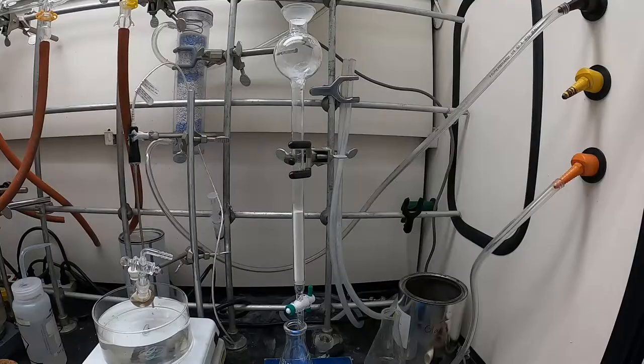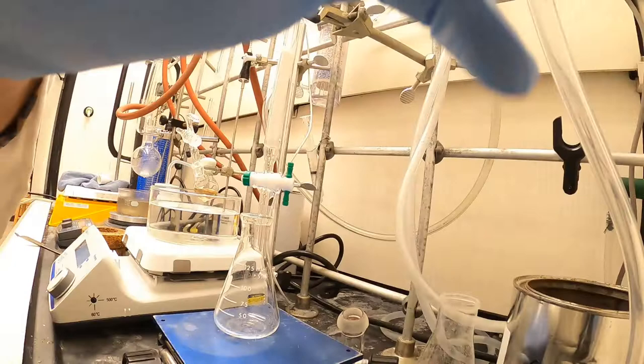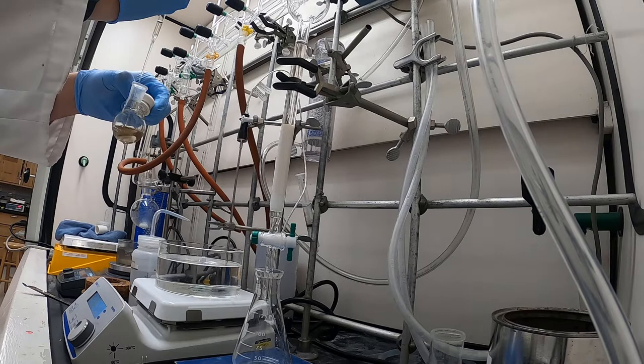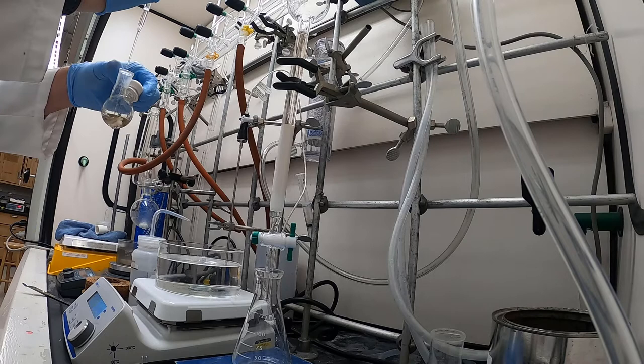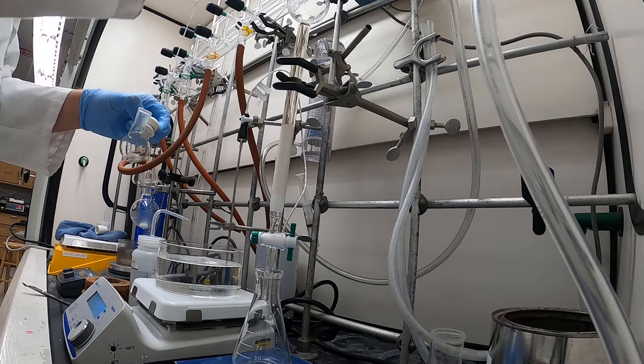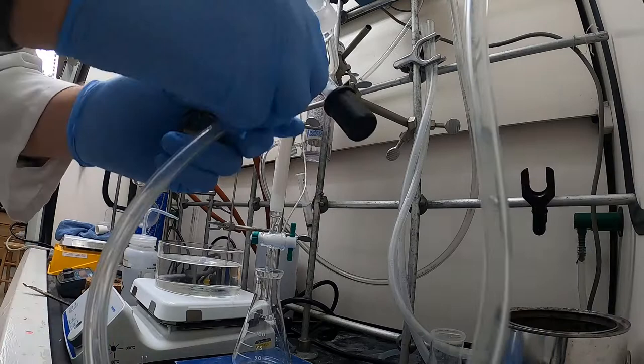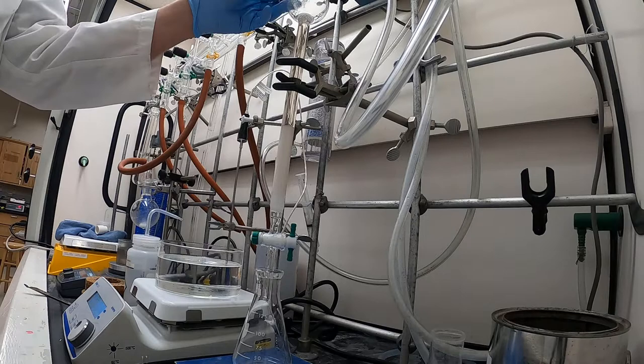To remove the copper catalyst, I will use a column filled with alumina. The copper should be stuck in the alumina while the rest of the reaction mixture will pass through the column. You can use pressure to make this process go faster, and usually I will add additional solvent to ensure I recover all of the polymer.